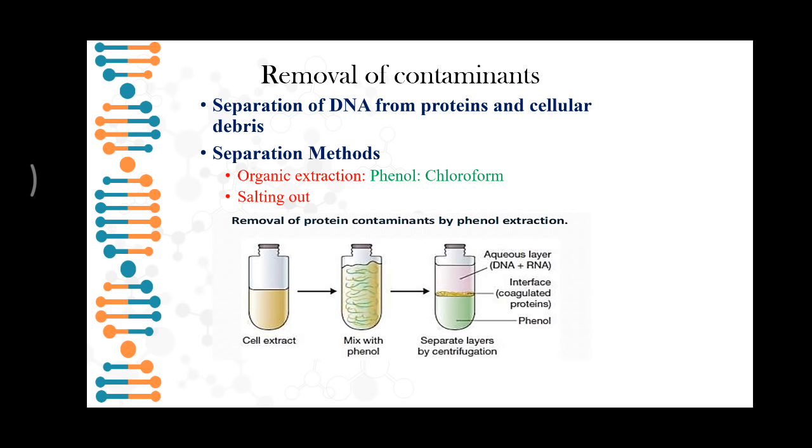Then removal of contaminants, that is a purification step followed by cell lysis, where the separation of DNA from proteins and cellular debris will be performed. Basically, we see two methods here: organic extraction, that is phenol chloroform, and salting out.